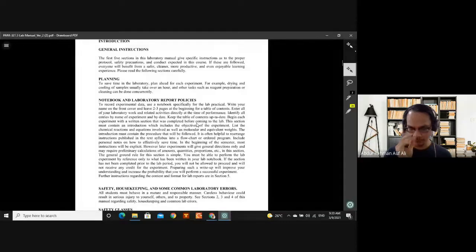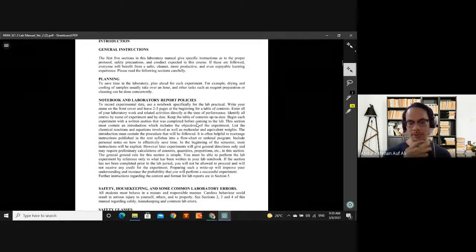But the face mask that we use dalam makmal kita dekat TPGUC is not up to standard lah, because dalam makmal sepatutnya kita pakai N95 carbon based mask. So this mask is a bit different than the surgical mask yang kita pakai masa for COVID ni, because those surgical masks only filter out liquid, small liquids, vapors, tapi dia tak protect, dia tak filter out chemicals, fumes, smaller particles of dust.